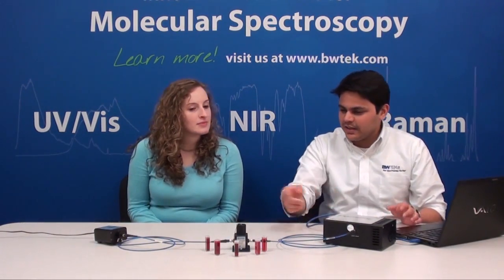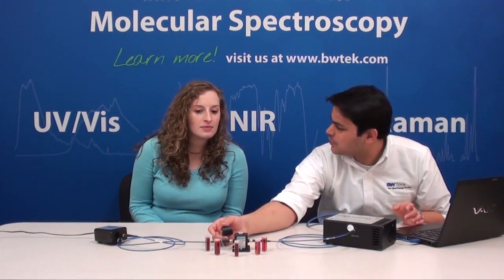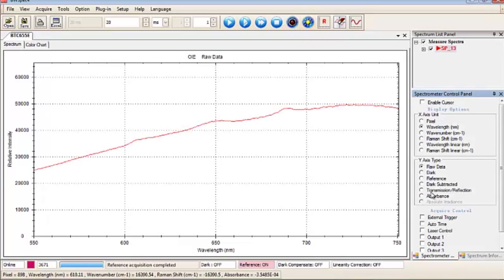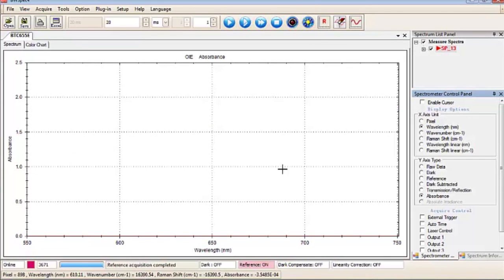So I think we have a reference sample, which is DI water, already in there. If I just take a quick reference scan, as you can see now, it's gone to zero absorbance.